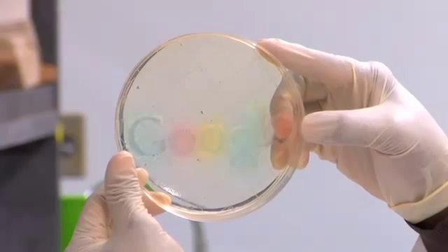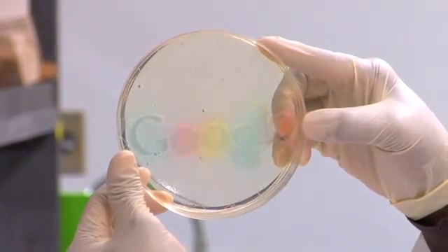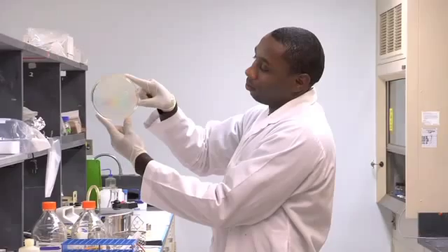Looks good. They've grown out in sort of a progression of colonies quite nicely. Here we have a living Google.